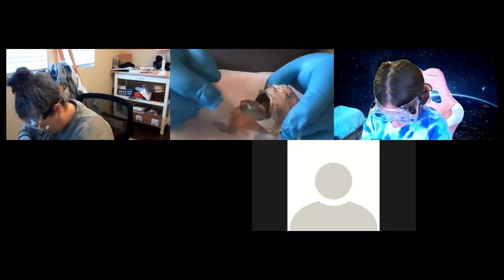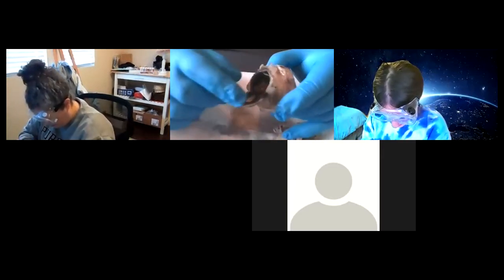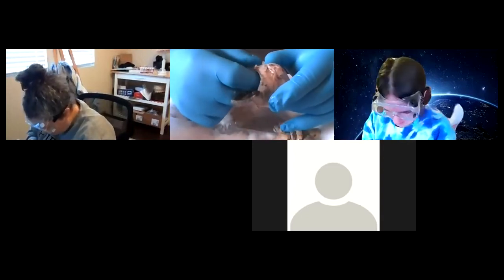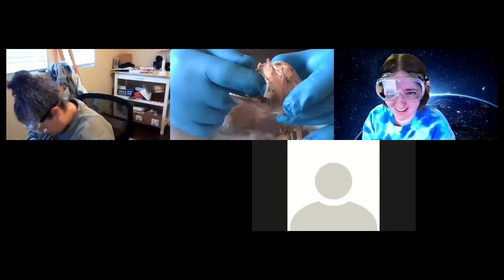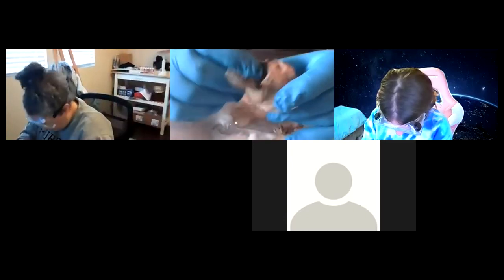Did you cut into the pupil to do that? No, I cut the cornea here — I'm actually behind. This is the first or second time you're able to actually feel things. You want to get acquainted with all that tissue you've learned.